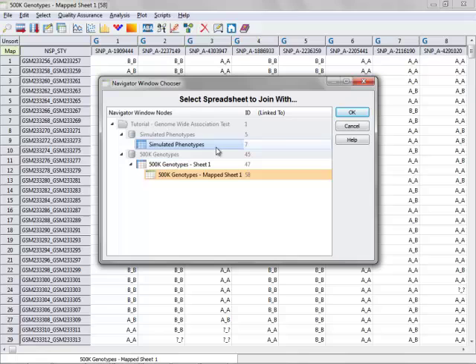It will then bring up the Join or Merge Spreadsheets dialog window. Ask me for a new data set name. I'll go ahead and leave that as is. And then it will ask me how I want to match the two spreadsheets. This is important, because you want to make sure that when you join your data, that the samples genotypes line up with their phenotypes.